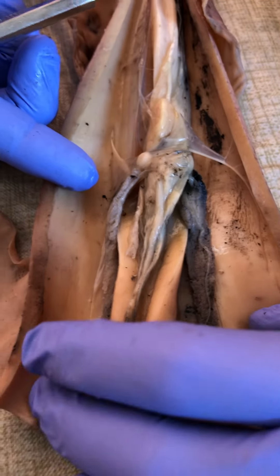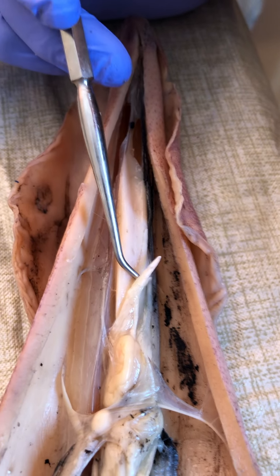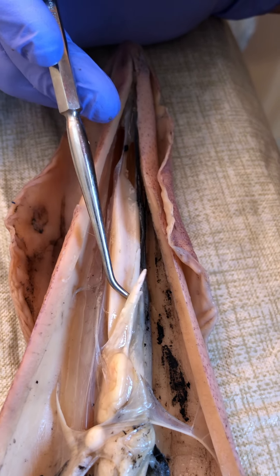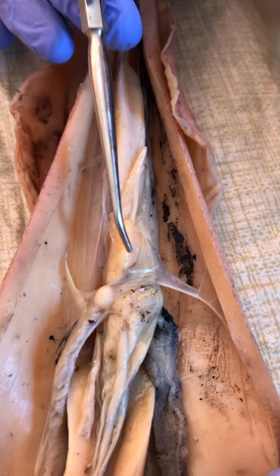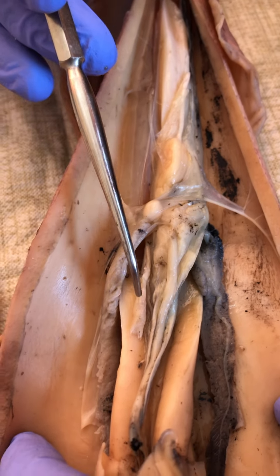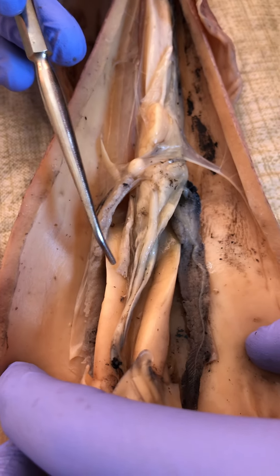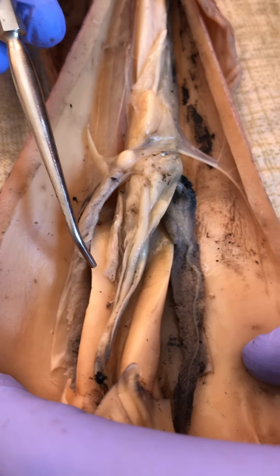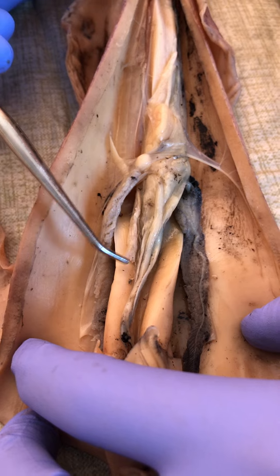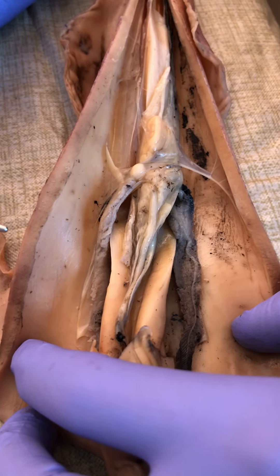Now what I'm gonna do is I'm gonna put my hand across here so I can hold that open. Right here there's the testis, and the testis is making sperm which are stored in the vas deferens, which is right here. And then a spermatophore is released right through the penis. And actually a mature male, one of his arms is gonna be specialized — I think it's the fourth one on the left side — and it would reach up through the siphon and grab the spermatophore and then deliver that into the female's mantle cavity.